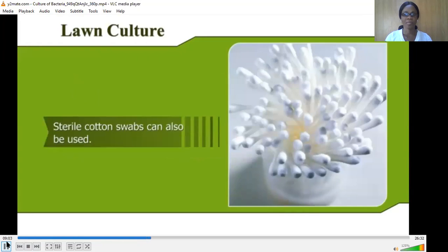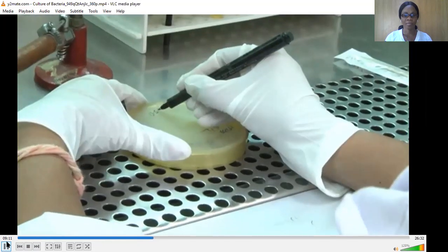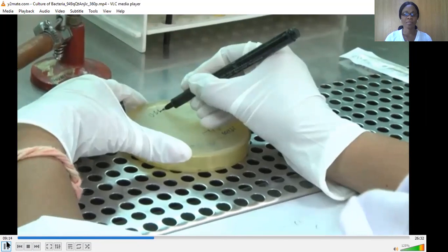Also, the preferred method and will be described to you. All the general precautions while inoculating the culture are as follows, which are to be observed before you start the procedure.